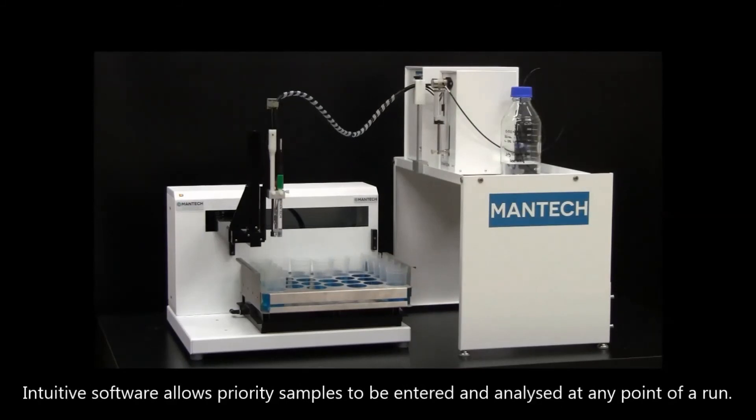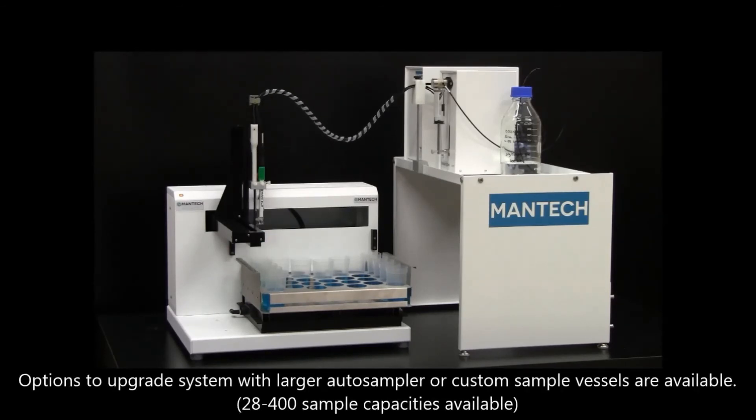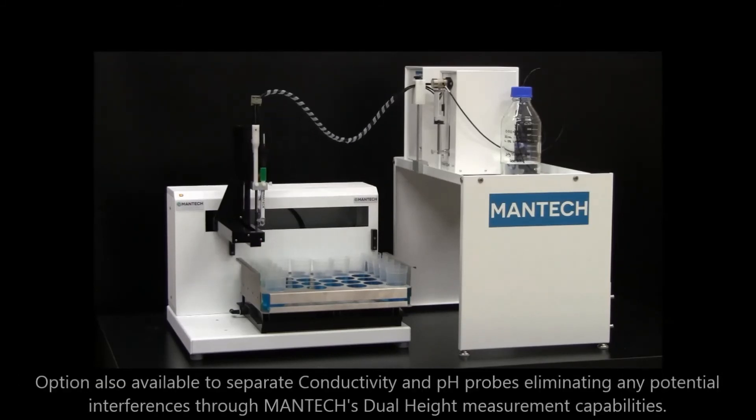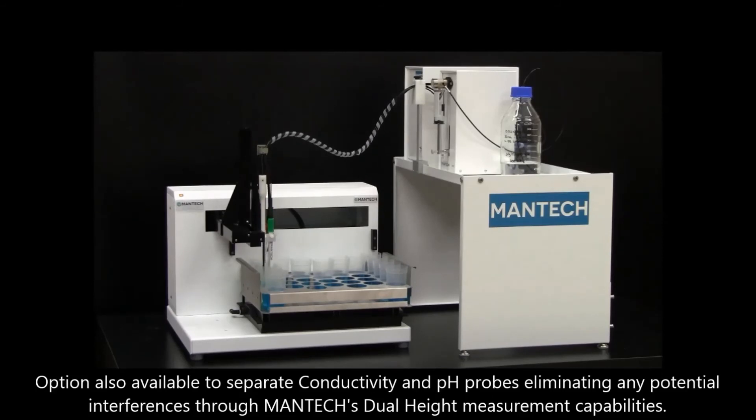Intuitive software allows for priority samples to be entered and analyzed at any point of a run. Options to upgrade the system with a larger autosampler or custom sample vessels are available. The option is also available to separate conductivity and pH probes, eliminating any potential interference.